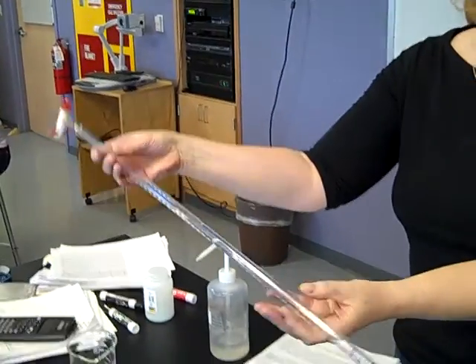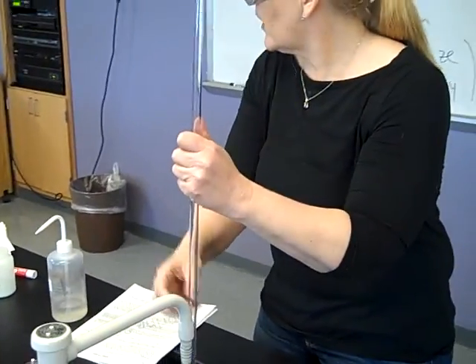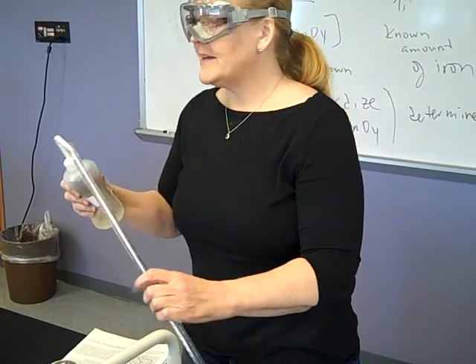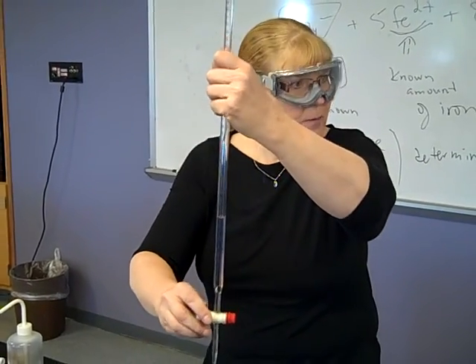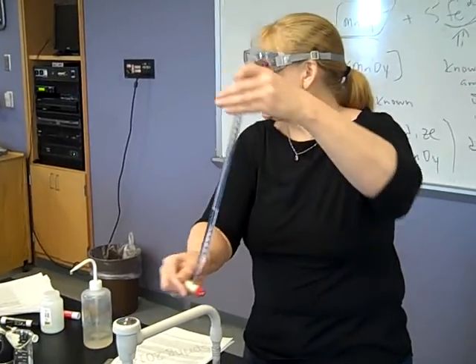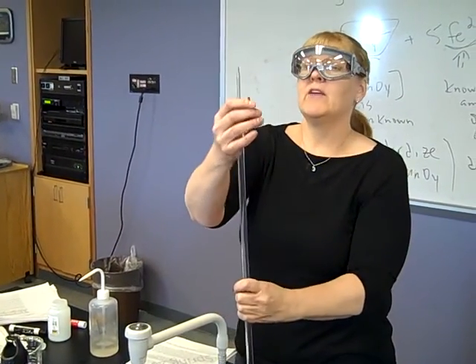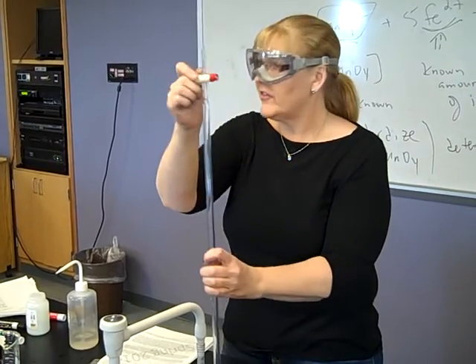When you lay it on its side and roll as you empty, you are going to replace the contents of whatever was on the side with the water. Do that three times. Then you're going to do the same thing with the permanganate, adding just a little bit to make sure that it's nice and clean. Don't put soap in, you'll never get it back out again. Make certain that there's liquid coming out of the tip as you do this, and that this is not too tight.